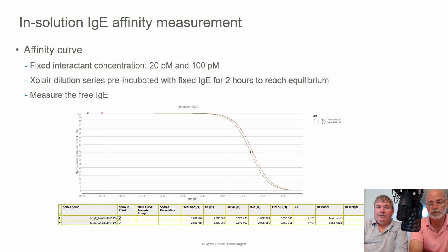Yeah, and as we mentioned in the previous podcast, as bioanalytical scientists, we like to see within 20% or whatever reproducibility, but that isn't necessarily appropriate for affinity. It's about being low picomolar, for example, or a very consistent nanomolar measurement. So if you've got 10 or 50, it's pretty much the same, for example.